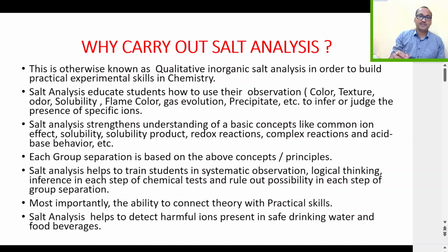Now the question arises, why do we carry out salt analysis? So this is otherwise known as qualitative inorganic salt analysis, in order to build practical experimental skills in chemistry. Salt analysis educates students how to use their observations like color, texture, odor, solubility, flame color, gas evolution, precipitate, etc., to infer or judge about the presence of specific ions.